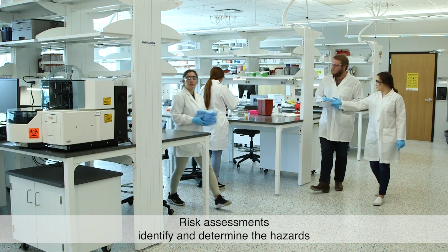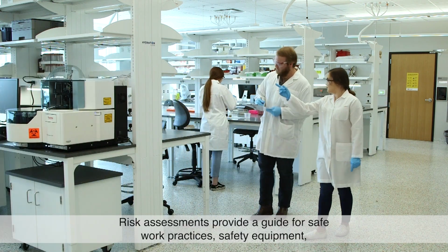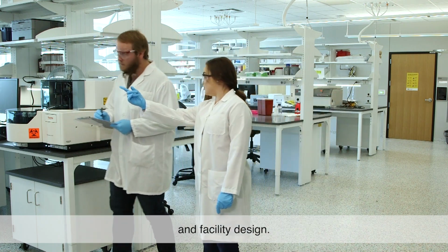Risk assessments identify and determine the hazards and containment levels for infectious materials. Risk assessments provide a guide for safe work practices, safety equipment, and facility design.